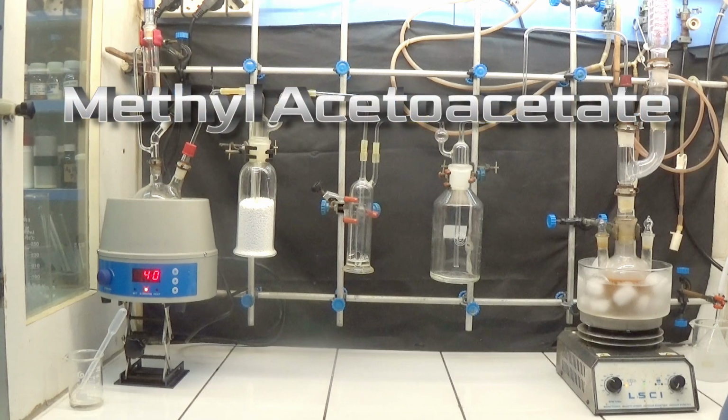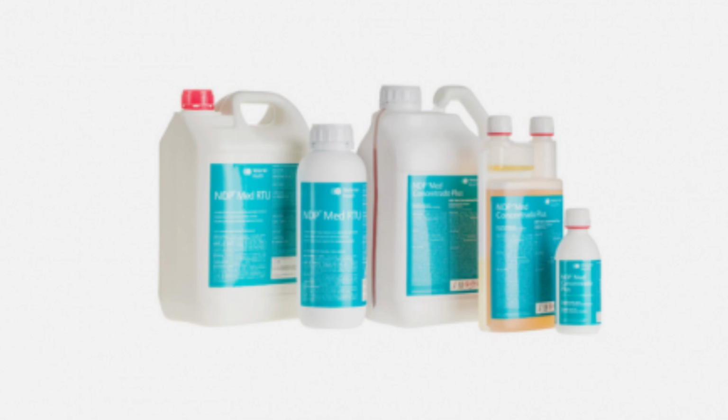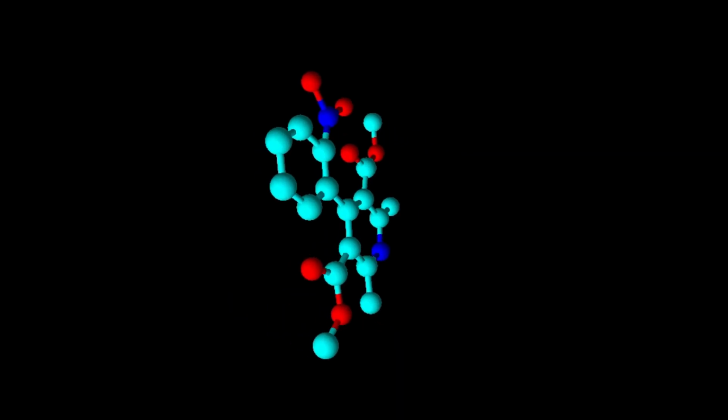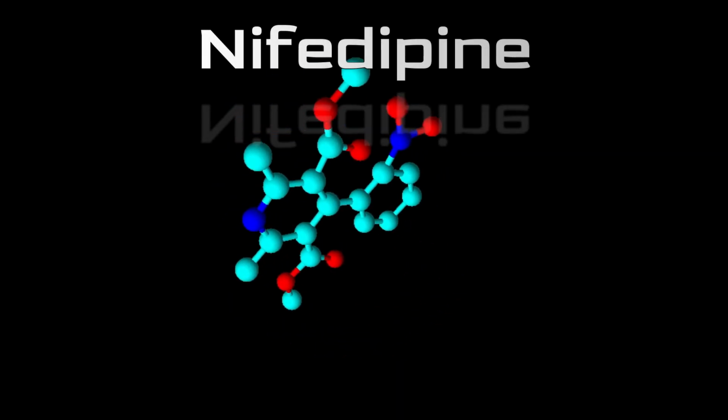In this video we are going to see how to obtain methyl acetoacetate. Methyl acetoacetate is used in the pharmaceutical industry as a sterilant and in the chemical industry as a solvent for celluloses and resins. My objective of this synthesis was to obtain raw material for the synthesis of nifedipine.